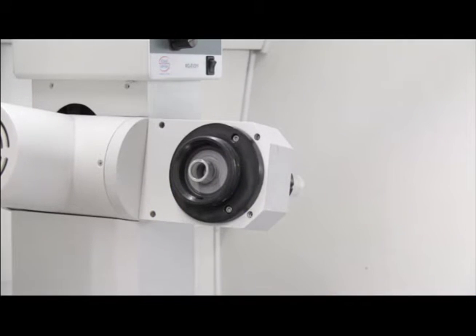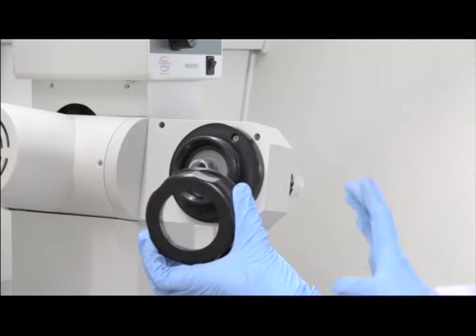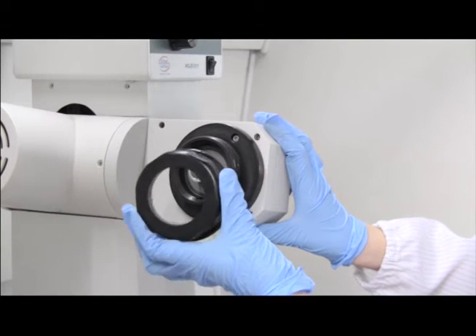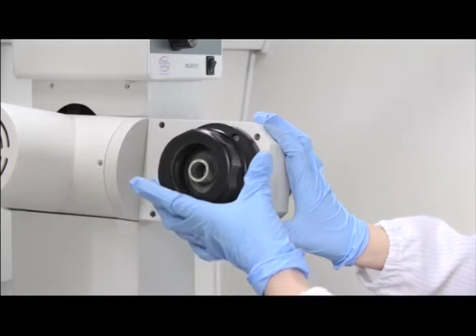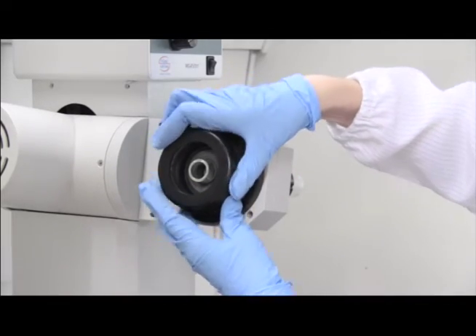Next we install the condenser. First make sure the spring ring has been installed in the union nut, then put the union nut on the screw and rotate it a few times. Do not tighten the union nut.